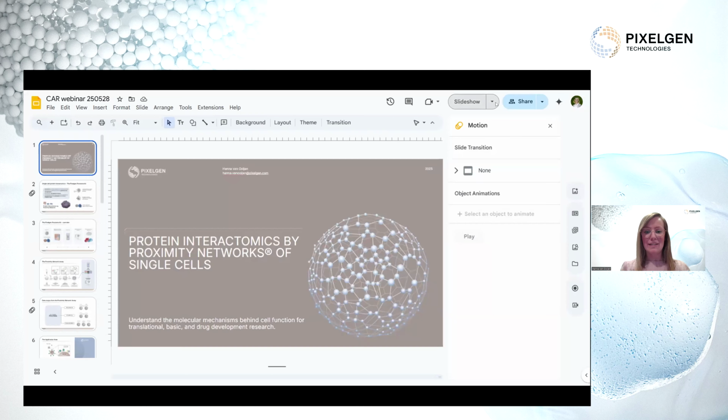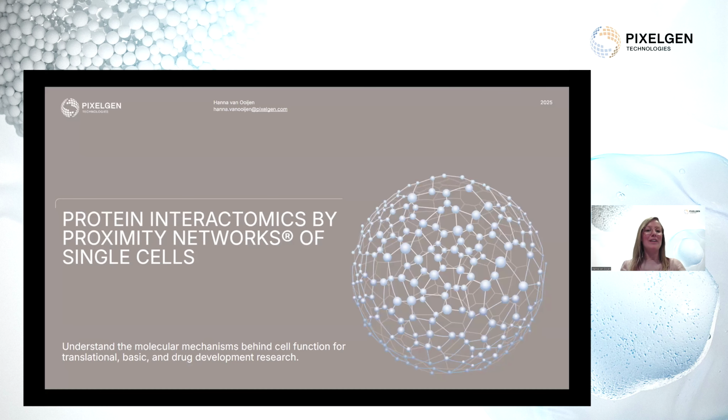So let's get into business. Today's webinar, as you've seen on the title and as on the description, will be about how we've applied the technology that we've developed at Pixelgen Technologies to study CAR T cells.